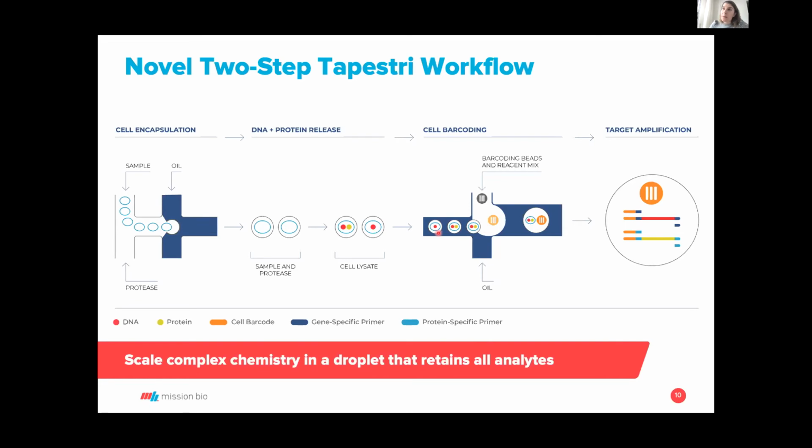Here is where we will be combining the genomic DNA of a single cell with all the primers needed and that unique barcode in order to amplify by multiplex PCR overnight these loci of your interest. So you will be combining the primers, the enzymes, your barcode, and your genomic DNA to do a multiplex PCR overnight. Essentially, what you generate is a nano PCR reactor where you have all the ingredients you require in order to do this amplification overnight. This is day 1, and day 2 is standard library preparation. So you break the emulsions and clean up the DNA and add the adapters for sequencing.